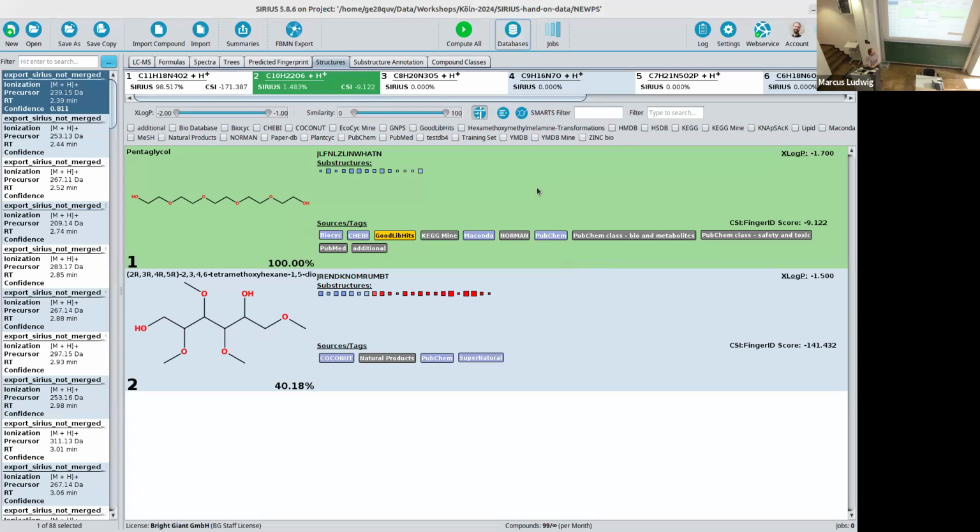Marcus: Yeah? I have a question. I normally, from my students and people that I collaborate with, always get the question with Sirius: let's imagine that you have the MS1s for a specific compound and all the MS2s for the top 5 in one specific retention time. So you have all these lists and you sort or filter by retention time. Can you work with all these features at the same time and get a better result for the annotation? Or is it done independently for each feature?